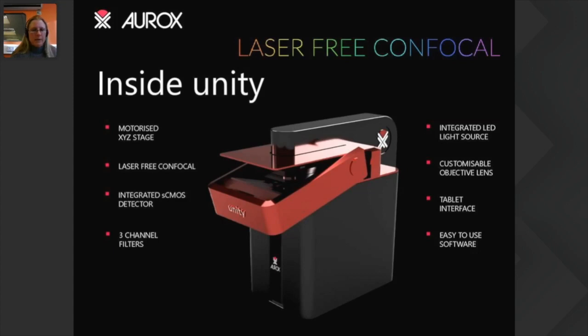So inside here, in this aperture, is the XY stage. And we have a range of sample holders. At the moment, we can either have a 2-slide holder, a 2 Petri dish holder, or a 96 well plate holder. These sample holders are designed to be removable and cleanable. Then you just insert them into this aperture and they'll be held in place by a couple of magnets. I can show you this again tomorrow. It's a little bit easier on the live instrument.